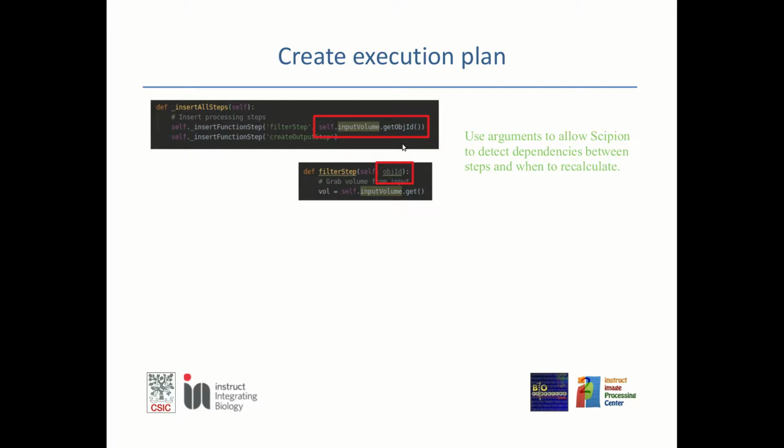We normally tend to put mostly the objects. So we define the re-execution based on which objects you are processing. But it is true that if you want to be pure, then you should also add the parameters of what is the filter you have applied, what are the parameters of the filter, and so on.